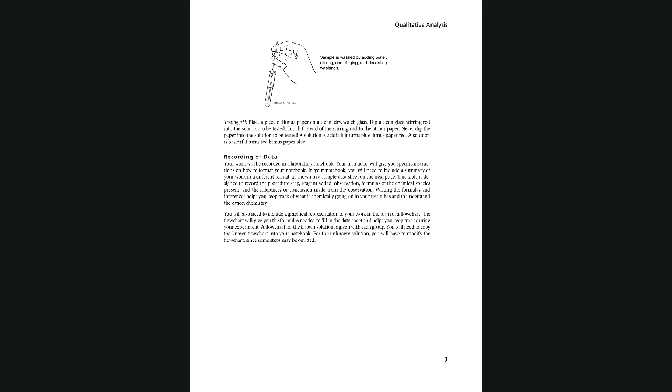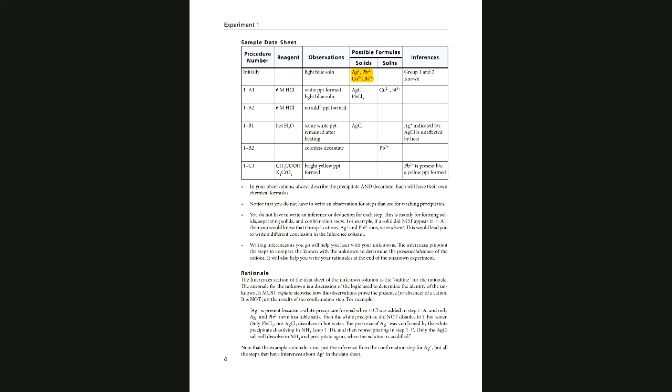We are going to learn about some of the lab techniques like precipitation and selective precipitation, and other theory that goes with the lecture. You also learn in the lecture about selective precipitation, where only certain ions precipitate when you add chloride, because chlorides are all soluble except for silver, mercury, and lead.